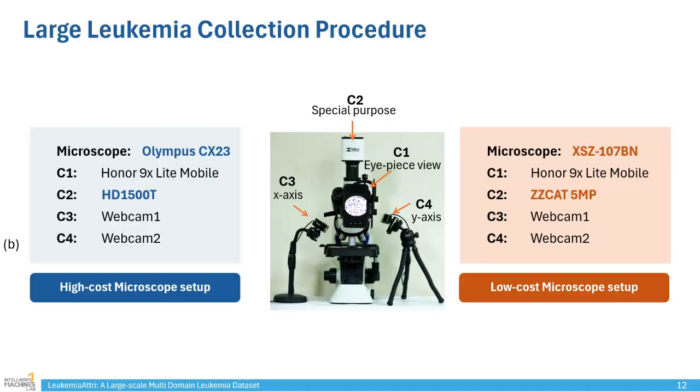For the ideal setting, we use the high-cost microscope with the high-cost camera, and for the optional setting, we utilize the low-cost microscope and a low-cost camera.